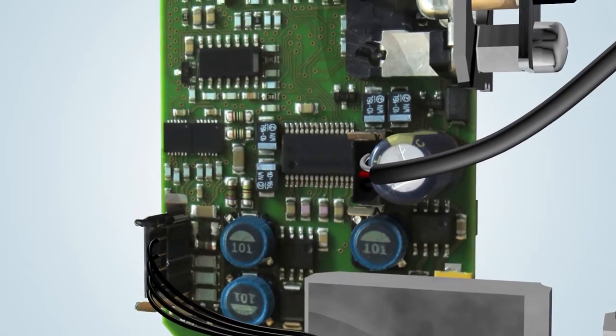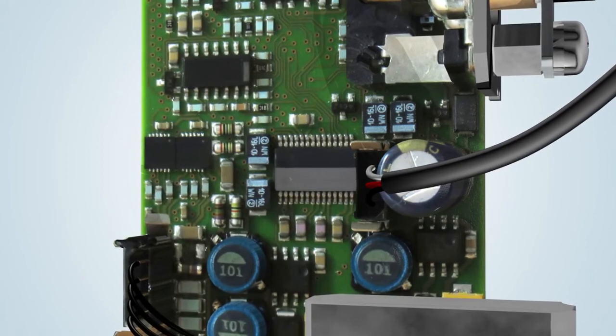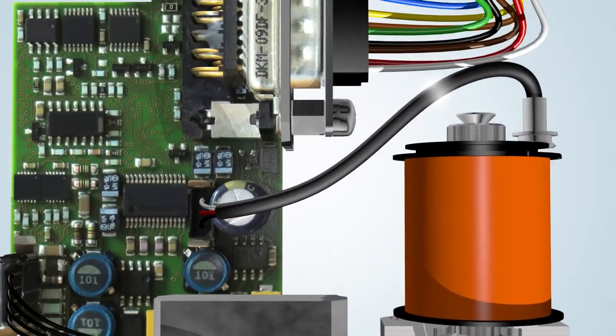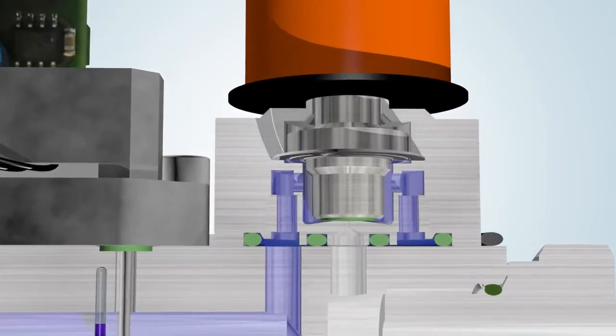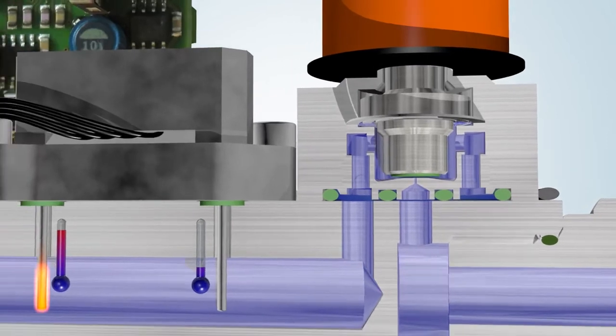The instrument receives a set point via the PC, PLC, or analog port. This required value is compared with the measured value. If the required value is higher than the measured value, the PID controller will actuate the control valve. The electromagnetic coil exerts a force on the magnetic plunger holder, which is in balance with the linear spring that normally keeps the control valve closed.